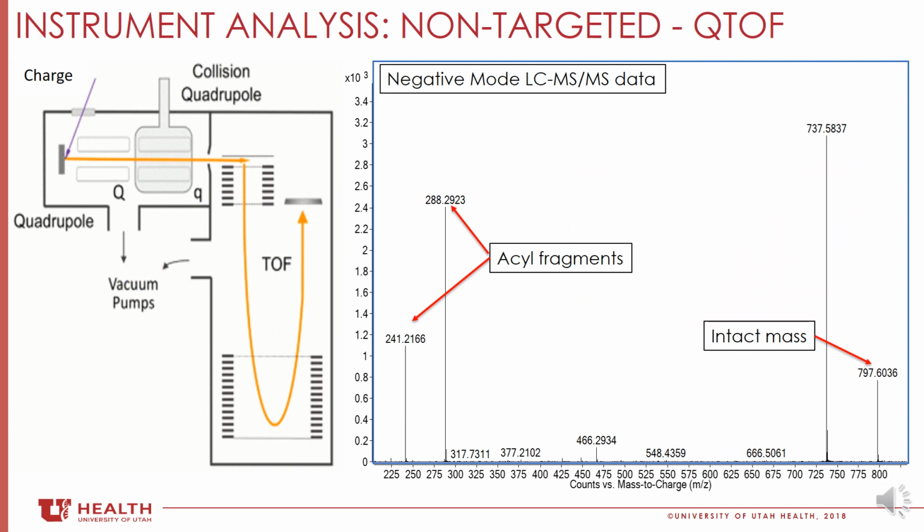Now some background on the two different mass spectrometers. The quadrupole mass filter, or QUAD for short, was invented a half century ago by Nobel laureate Wolfgang Paul, and has become an integral part of some of the most sophisticated mass spectrometers. Consisting of 4 parallel metal rods on which a fixed direct current voltage and alternating radio frequency voltage are applied, quads allow users to selectively filter all ions except those of a specified mass to charge ratio, noted as M/Z, depending on the applied voltage.